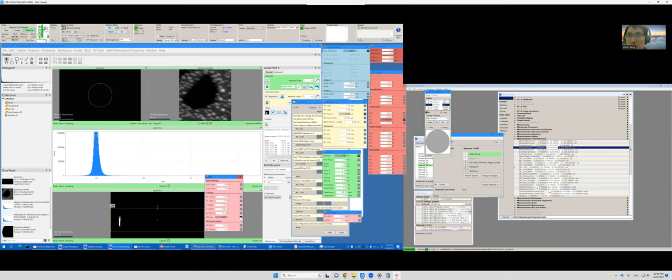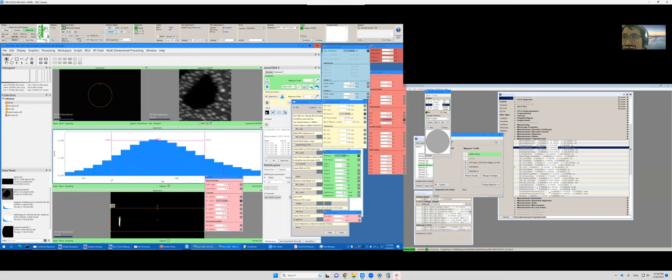Okay, it is good. It looks like the system is quite stable now. We're constantly reading 10 or 11 millielectron volts for full width at half maximum, or resolution. So that is good.